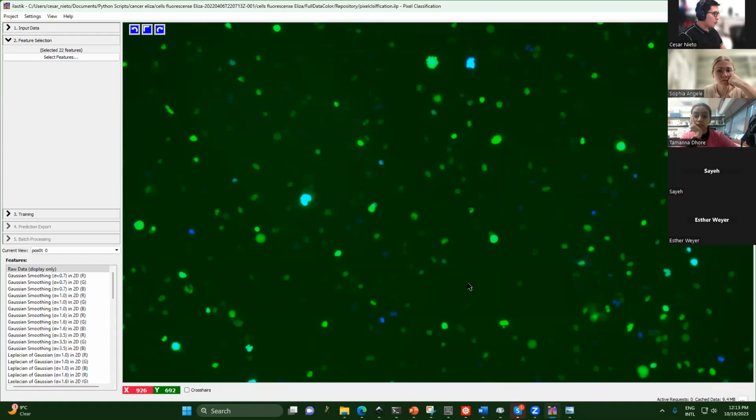Okay, so now the program is setting up the neural network, and we can go to training now.